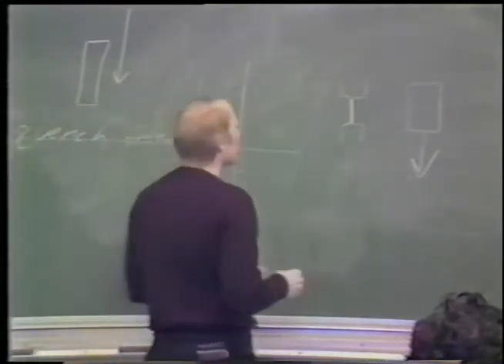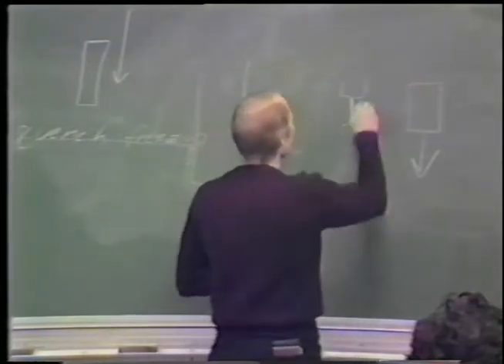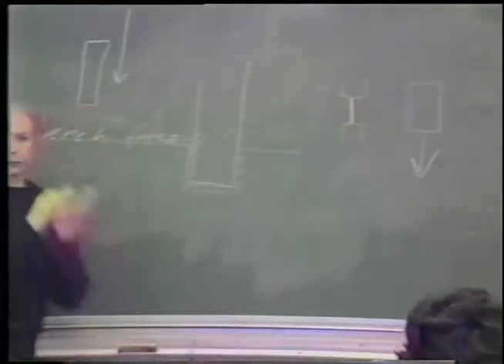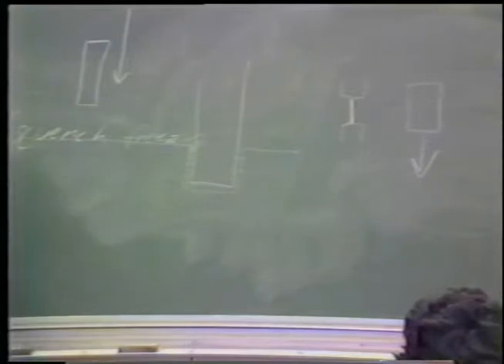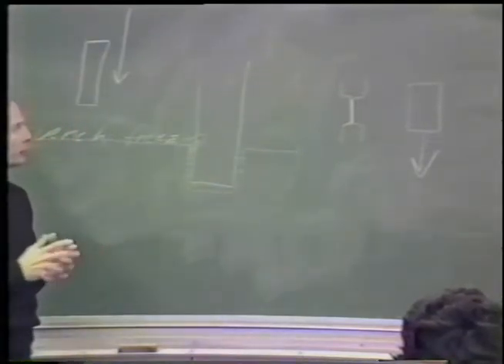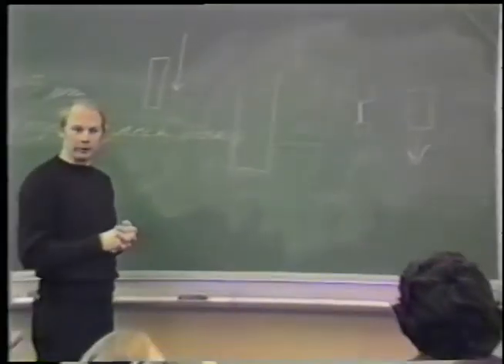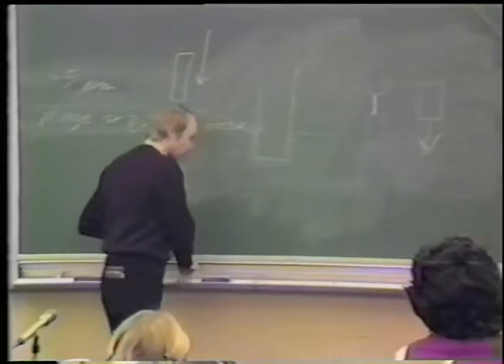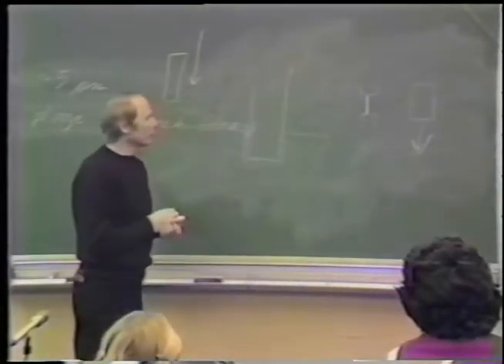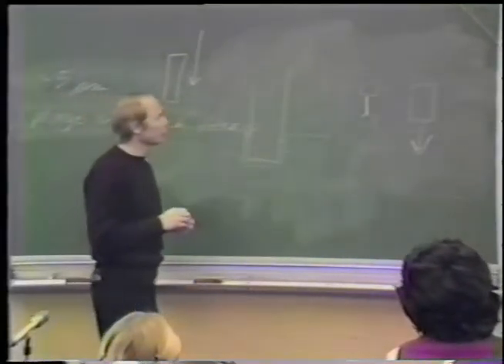And this way, you've streamlined the sample so that you can get maximum flow over the surface of the metal and get maximum rate of transfer, or maximum rate of replacement of the cryogen, sweep away the vapor barrier, and manage to accomplish a rate of heat transfer large enough to get freezing in a sample of about this thickness.